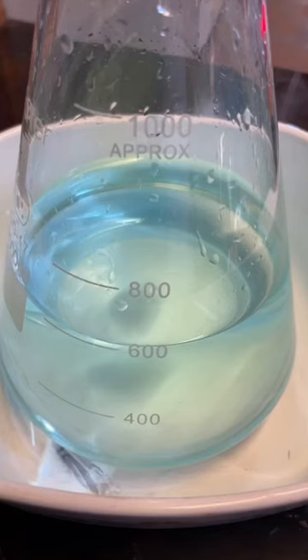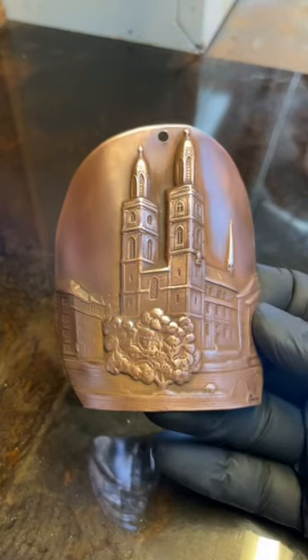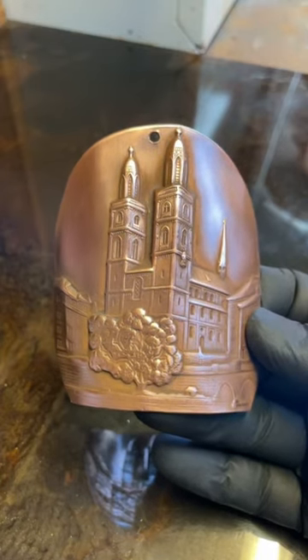I've got 600ml of a very dilute silver nitrate solution and today I'll be dropping it out on this copper relief of the Grossmünster Church in Zurich, courtesy of SIG.